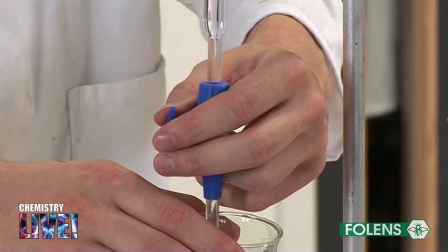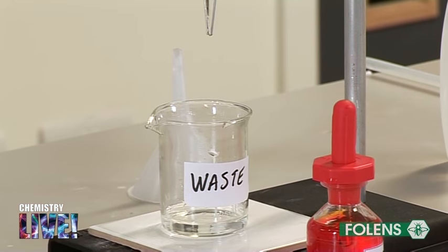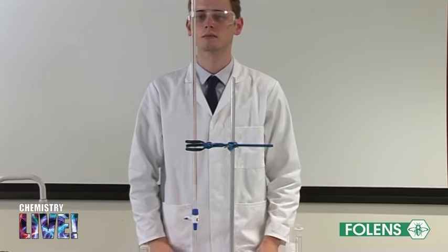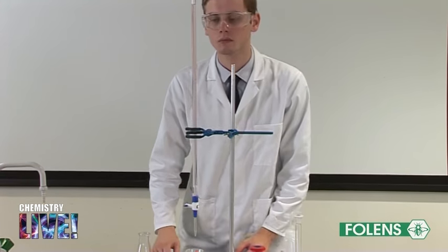Using the thumb and first two fingers of the left hand, open the tap of the burette. Allow the solution to run slowly into the beaker marked waste until the bottom of the meniscus is opposite the zero graduation mark. Check that there are no air bubbles in the nozzle.